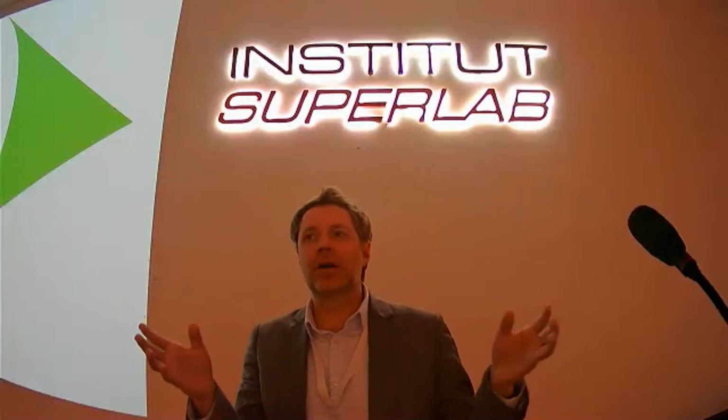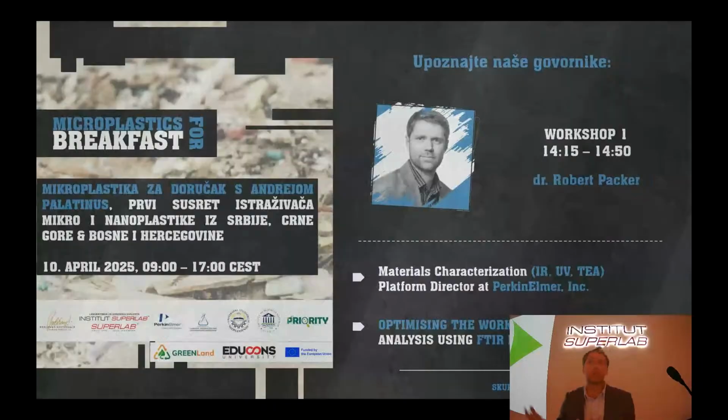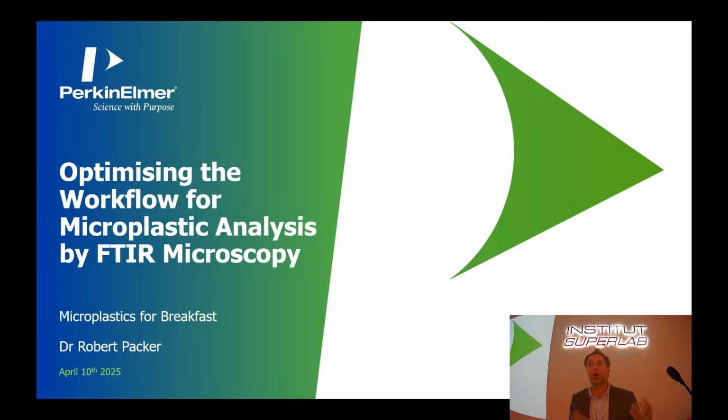And I think everyone in here now would have sat downstairs with Roberto and gone through the training. So I wanted to make sure that I'm not repeating a lot about what he said, but actually some questions were about when should you use reflectance versus transmission versus ATR. I've got that in here. What sort of filters are good for FTIR as well? So it's a bit more generic about improving. And then towards the end of the presentation, I'll talk a little bit about what's coming next in the future as well. You'll actually be the first people in the world to hear this.